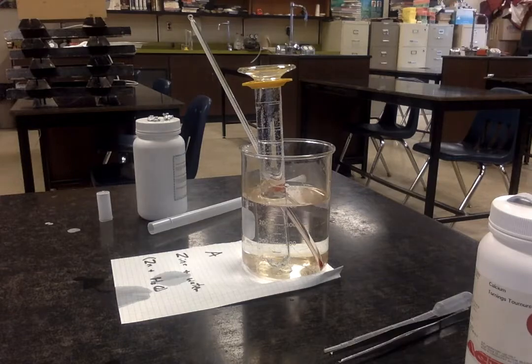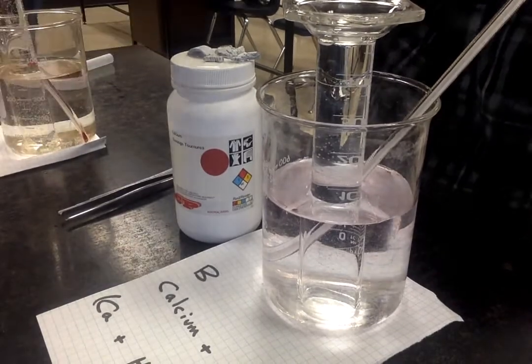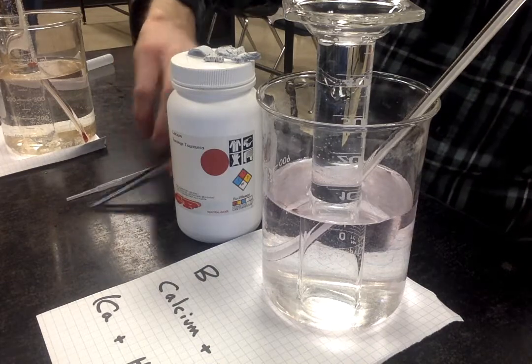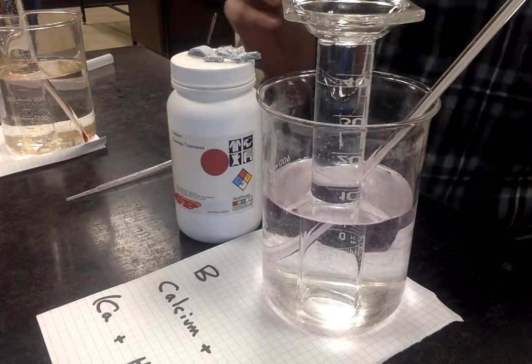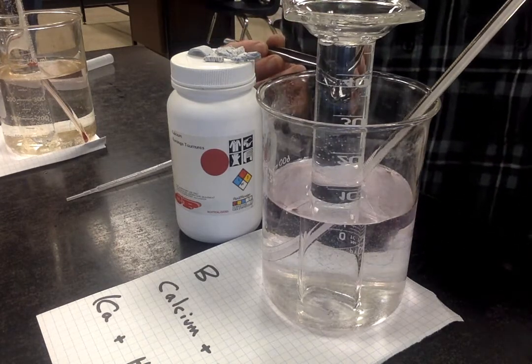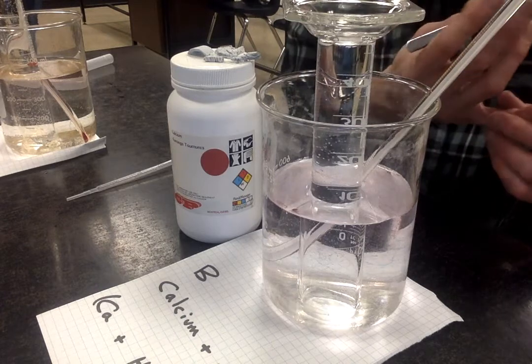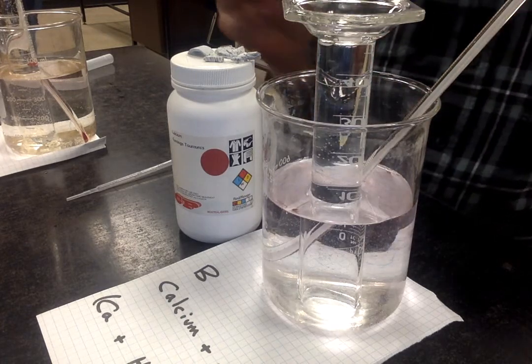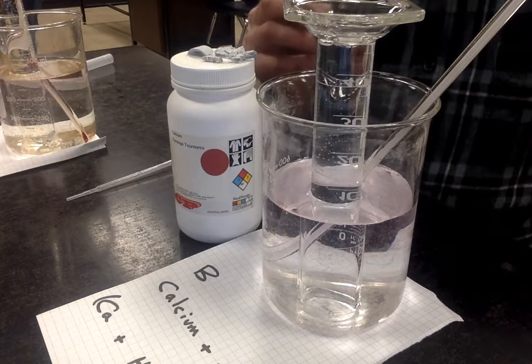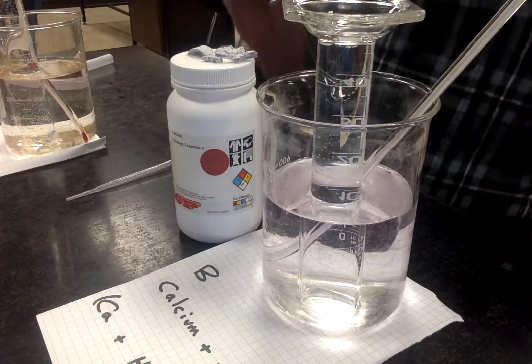I'm going to shift this other experiment over. And there. This will allow us to see any reaction that happens involving the calcium. Calcium metal is coated in air. It reacts with the air, with the oxygen that's naturally in the air. And when that happens, it makes calcium oxide. Calcium oxide can react with the water that's naturally on your hands if your skin is slightly moist, which it should be, very slightly. That can make a strong basic compound on your hand and can cause corrosion burns to your skin. So for this reason we use forceps.